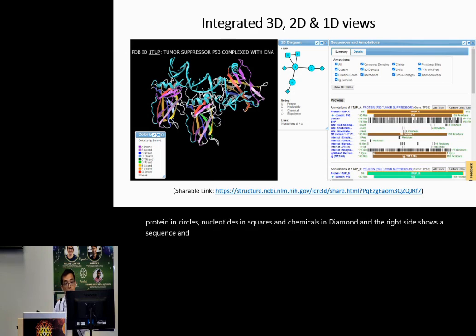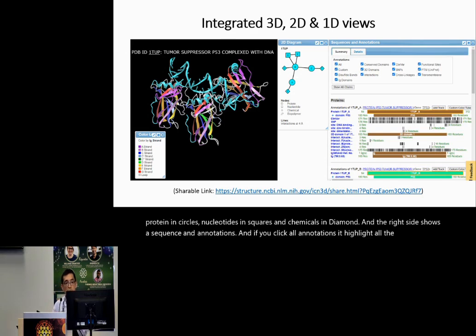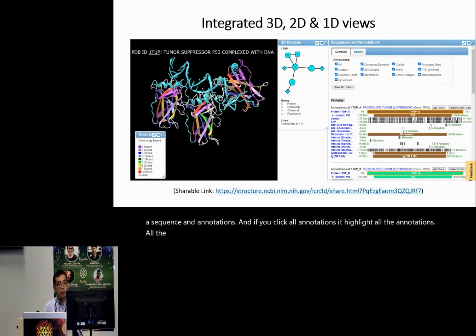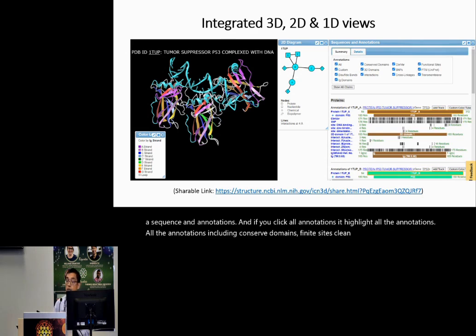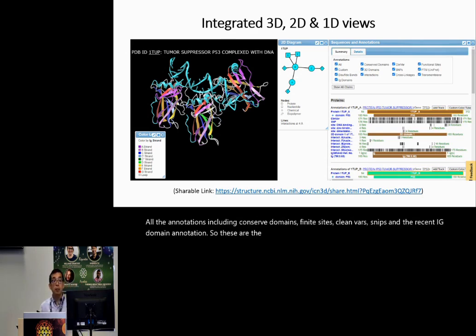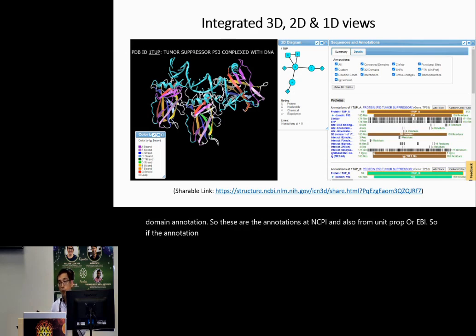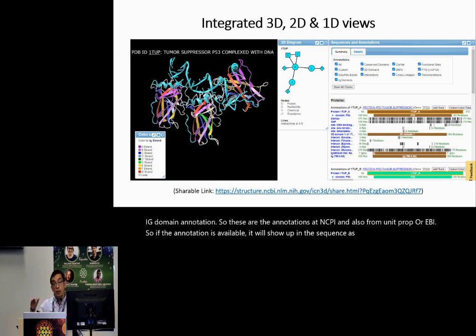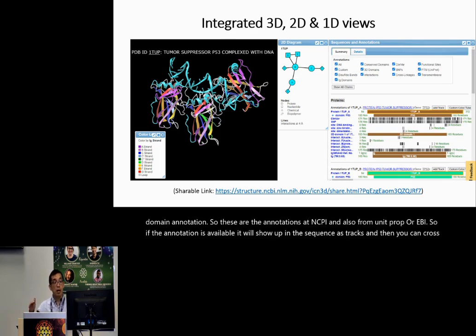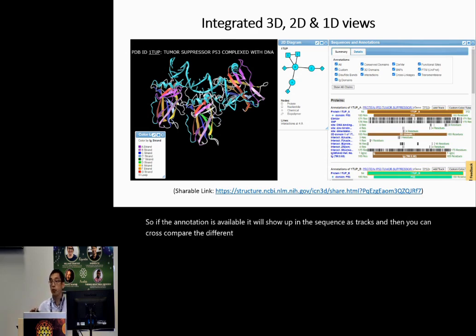If you click all annotations, it highlights all the annotations, including conserved domains, SNPs, ClinVar, and the recent IG domain annotations. These are annotations from NCBI and also from UniProt or EBI. If an annotation is available, it will show up in the sequence as tracks, and you can cross-compare different annotations at different residue positions.